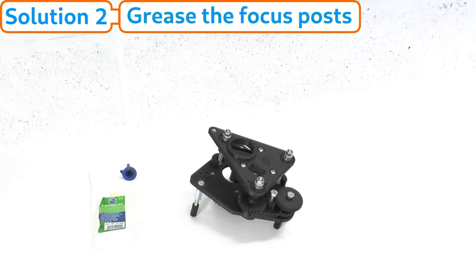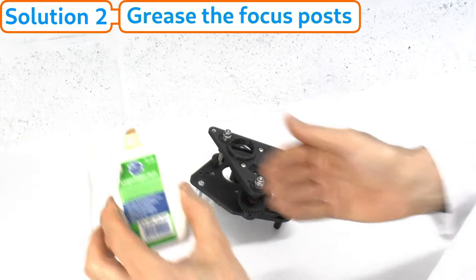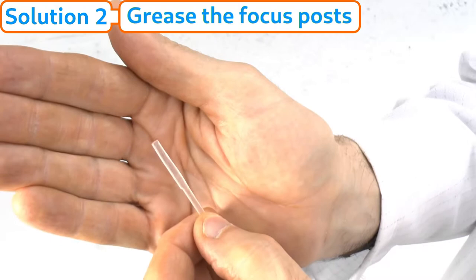This is the procedure to grease the focus mechanism of the Puma microscope. For this you'll need some form of thick gel-like axle grease, and a thin plastic applicator will help.